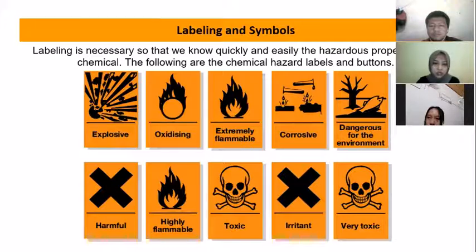Flammable, hazard: flammable. Example, butane and propane. Safety: avoid mixture with air and avoid sources of ignition. Toxic, hazard: toxic, dangerous to health if inhaled, swallowed, or in contact with skin, and may be lethal. Example, arsenic trichloride and mercury chloride. Safety: avoid contact or entering the body, seek medical attention immediately if poisoning is possible.